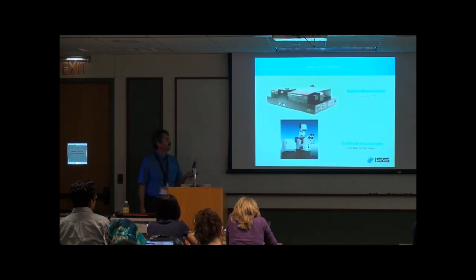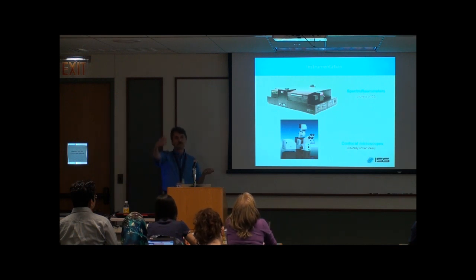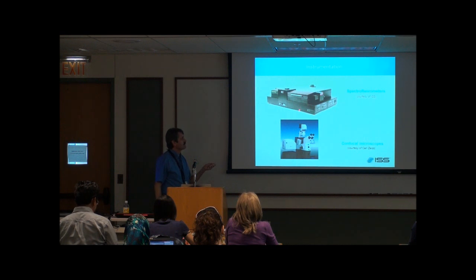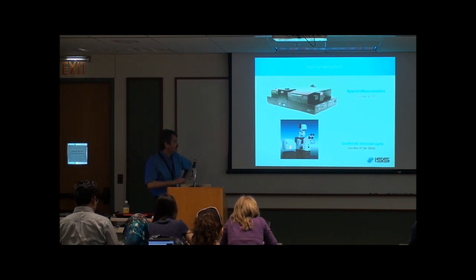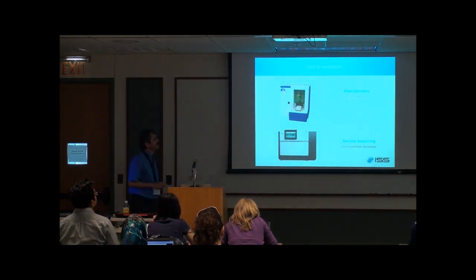There is a variety of instruments, gadgets, that are used to carry out all the different measurements of fluorescence. This is a classic fluorometer that you will see next week during the course, during the practical in the laboratory. It's a confocal microscope. We have a flow cytometer. This is made by Eyesight, a local company.